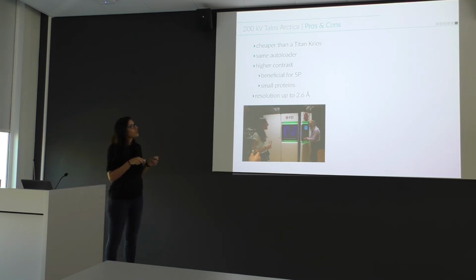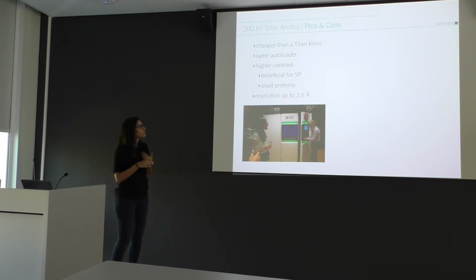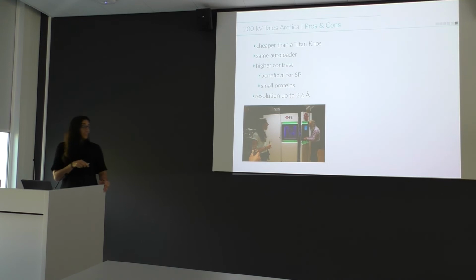And the important take-home message here is, of course, the tighter, always better, and you will always obtain higher resolution. But at least with the proteins that I'm working with, membrane proteins, my targets are normally the resolution limiting factor and not the microscope itself. So this is why I'm often not so worried, because I'm realistically not aiming for this resolution anyway.